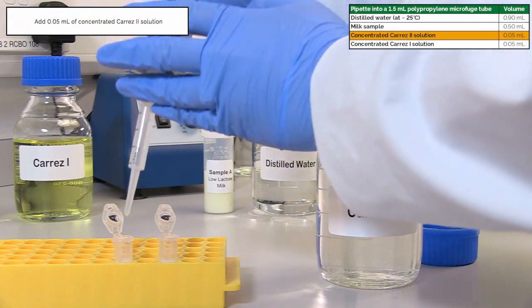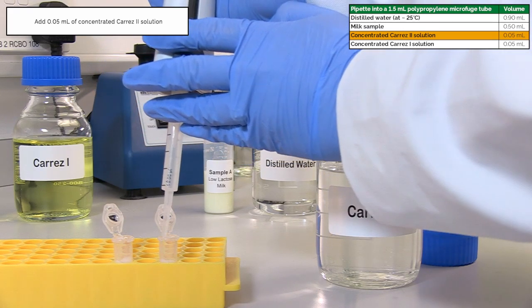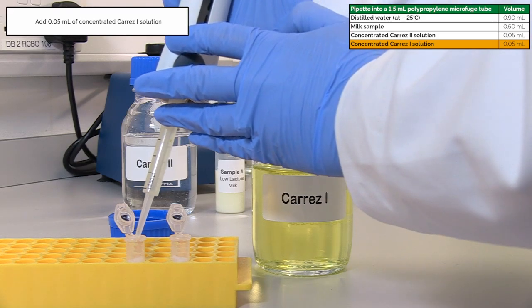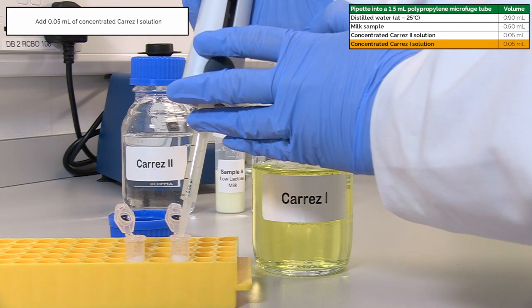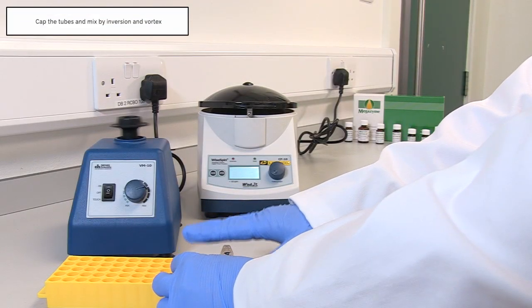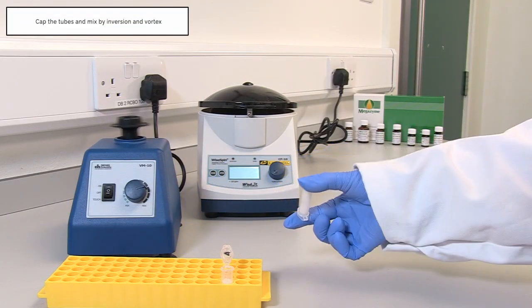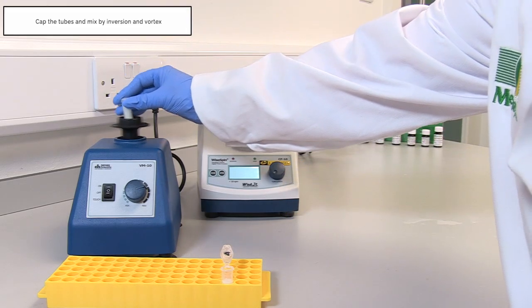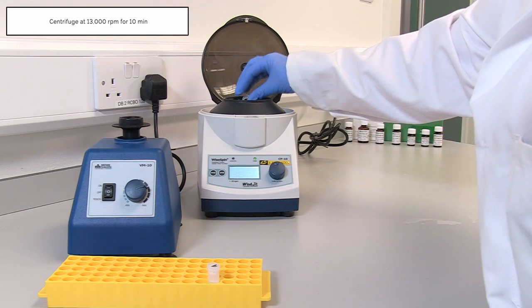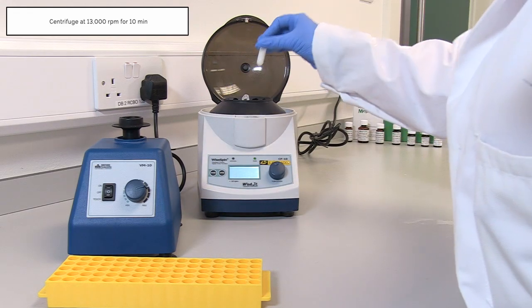Add 0.05 milliliters of concentrated Carrez 2 solution. Add 0.05 milliliters of concentrated Carrez 1 solution. Cap the tubes, mix by inversion and vortex, and then centrifuge at 13,000 RPM for 10 minutes.